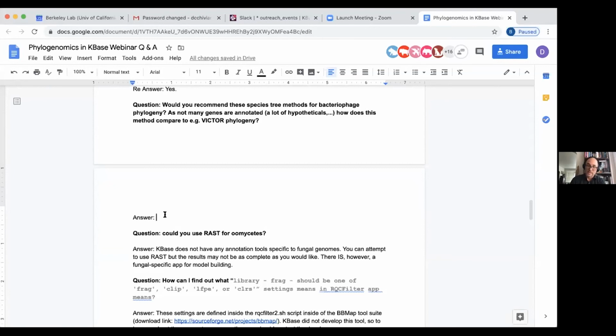So again, using that pangenome slicing, you could use the circle plot to do that slice to get the core set. Chances are they're single copy because these things are so tiny, but you could do an extra check to make sure it's a single copy representative. I doubt it's necessary for phage.